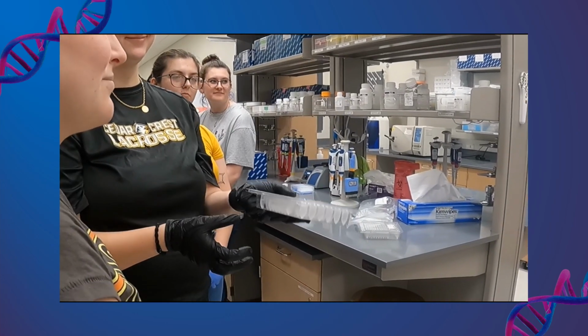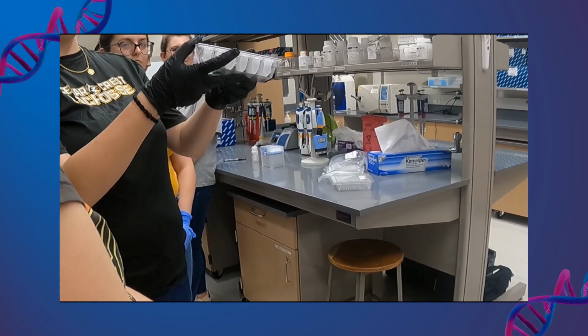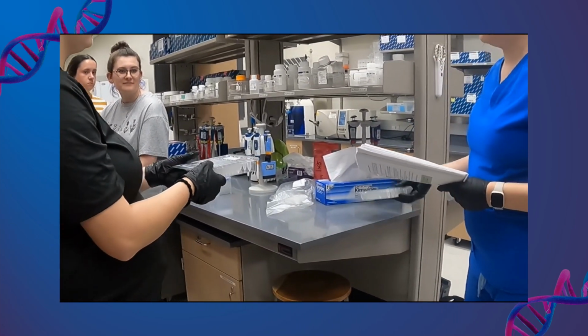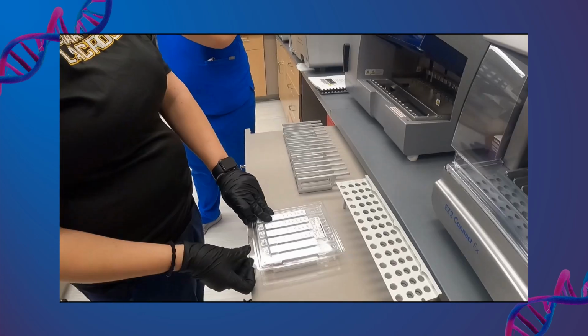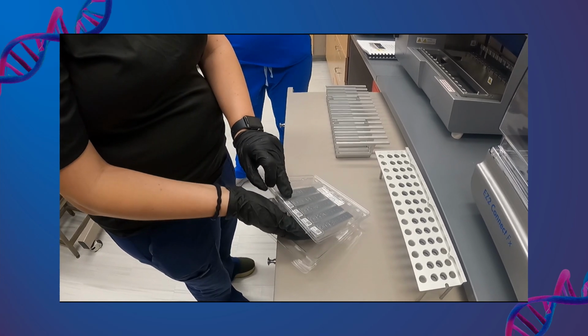First, the magnetic beads in the reagent cartridges must be prepared for each sample through agitation and shaking. The beads are used for purification because they bind the DNA in a sample and allow the contaminants to be washed out. Next, the reagent cartridges are loaded into the slots in the instrument.